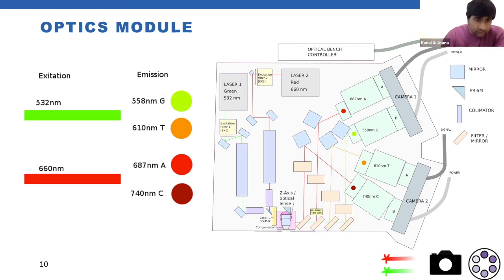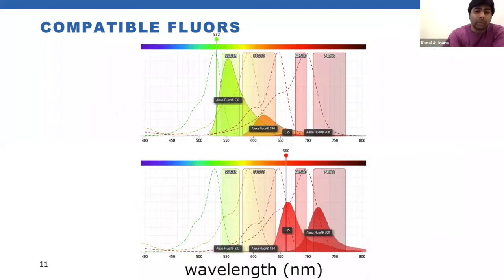With these excitation lines and emission filters, finding fluorophores is a little bit challenging though. The emission bands are pretty tight, so spillover is inevitable. For example, we can excite fluorophore 532 and fluorophore 594 with the green laser, but from the emission of 532, there's significant spillover into the adjacent channel with fluorophore 594. Similarly, we can excite Cy5 and fluorophore 700 with the red laser, but spillover from Cy5 into 700 is a problem.